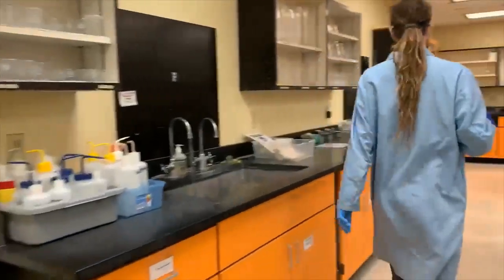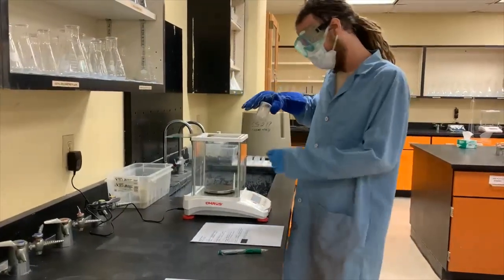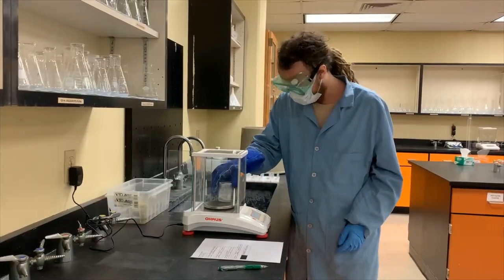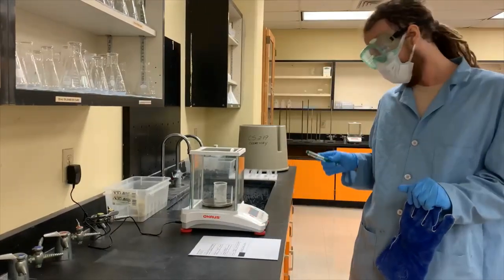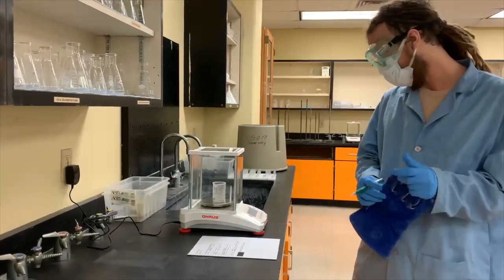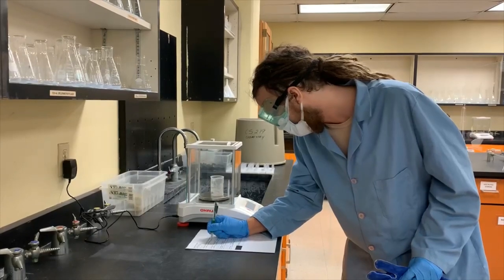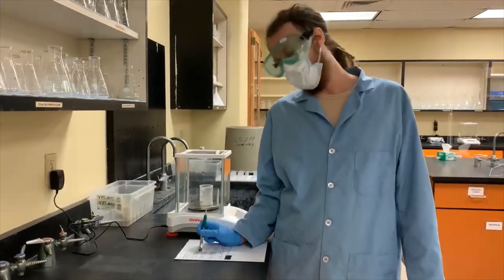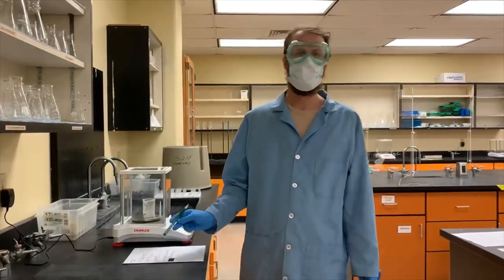So here we go, and take these back to our balance. We've made sure it's tared. And we're just gonna set it on the balance. And this is beaker one. So we're going to go ahead and record the mass, which I got here as 51.333 grams. And basically, you're just going to want to subtract the mass of the beaker without the salicylic acid from the mass of the beaker with the salicylic acid, and that'll give you the mass of the salicylic acid.